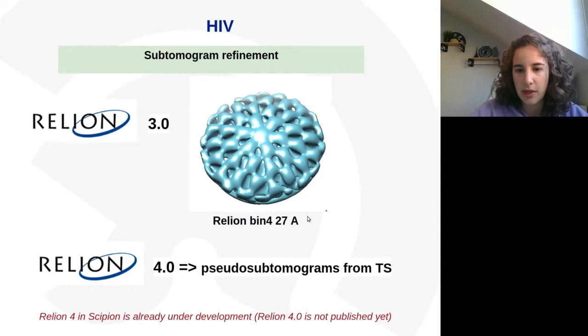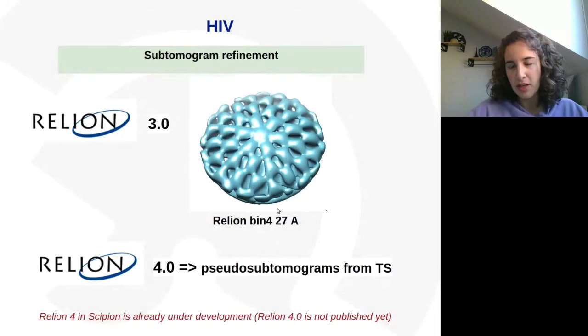The same happens here as with the first workflow. The resolution is not as good as the one published in the papers because, as Patricia said before, we are working with toy datasets, with a very small dataset, with the tomograms in bin 4, and just one tomogram, picking just a few particles. Otherwise, the execution would run for a long time, and we don't have that time to perform the complete workflow. So we are working with a toy dataset just to finish it in the afternoon. That is why the final resolution is not so good.